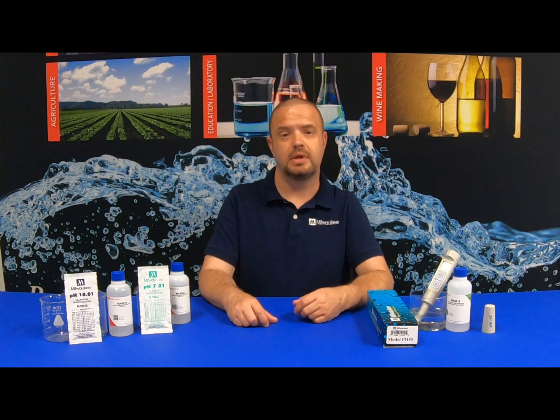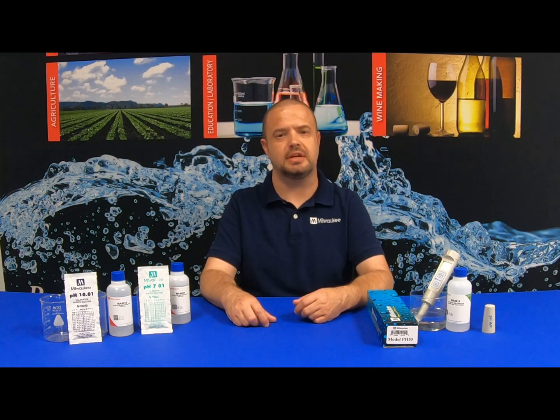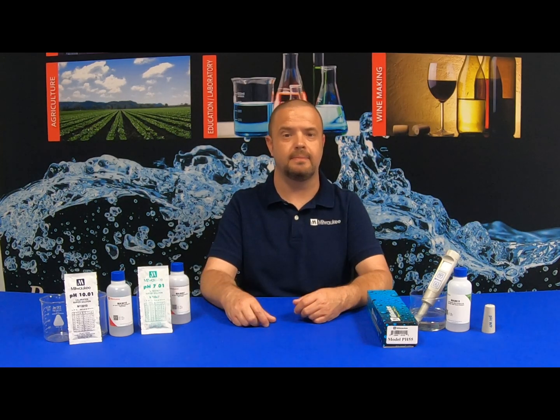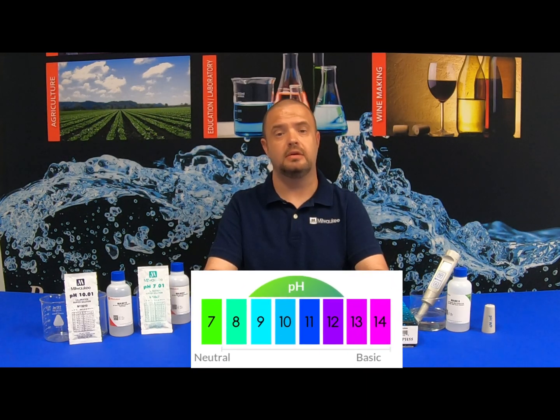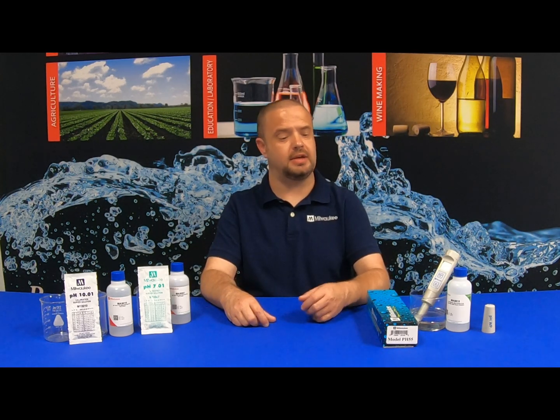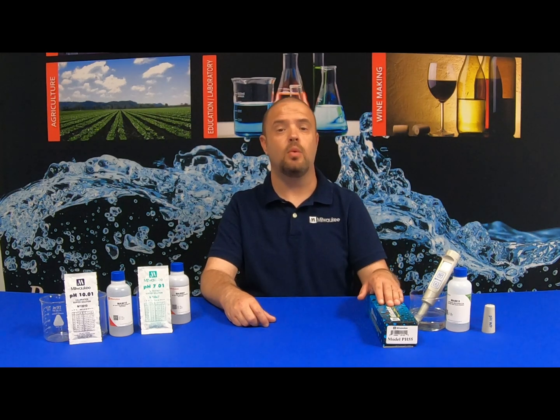When using a two-point calibration, you're actually able to narrow down the pH accuracy of what you're testing. For example, if you're testing something more acidic such as beer and wine, you would want to calibrate using seven and four calibration solution. If you're looking to calibrate something more basic, such as a saltwater tank, you would want to use seven and ten calibration solution. For today's exercise with the PH55, we are going to calibrate using seven and ten calibration solution.